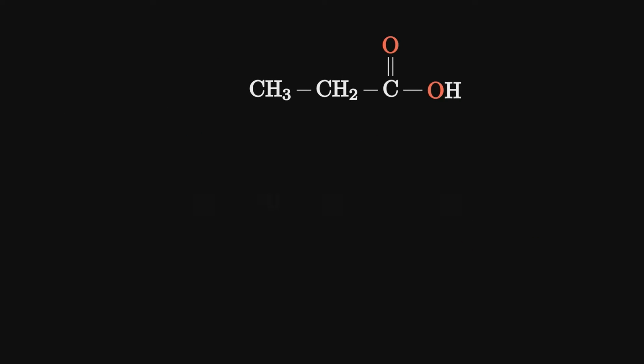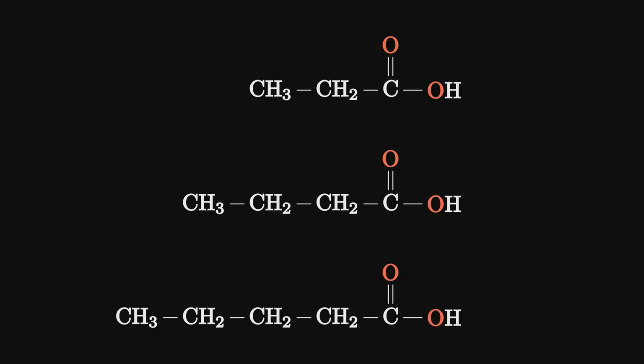Now on to the carboxylic acids, where I'm going to simplify the animations even more. From here, I will just highlight the fragments you should expect to see. I suggest trying with paper and pencil to determine the mechanism for each fragmentation and if charge is shared among atoms in the fragment. If you're feeling a bit of deja vu, it's not a glitch in the matrix. All I did was switch out the amine groups from the previous molecules for the alcohol.